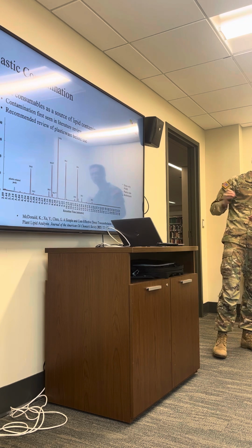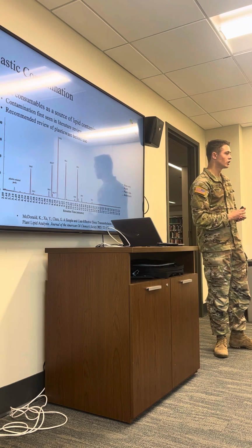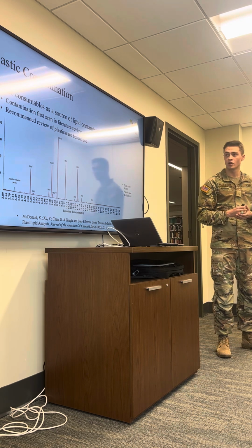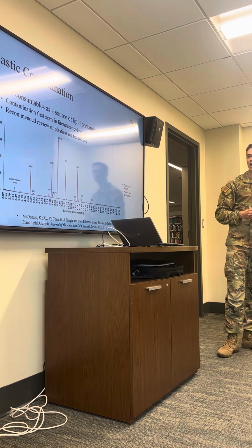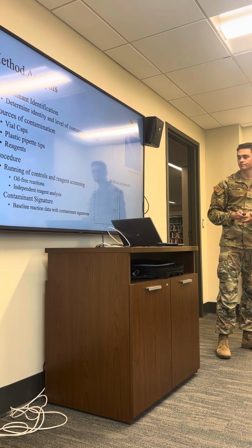And so it is important to note that during the early stages of the research project, a literature review was conducted. And in one of the papers, which is very similar in nature to ours, it dealt with the lipid analysis of plants, contamination was noted through the use of plasticware, and the article recommended individual lab review of the plasticware before you use it.